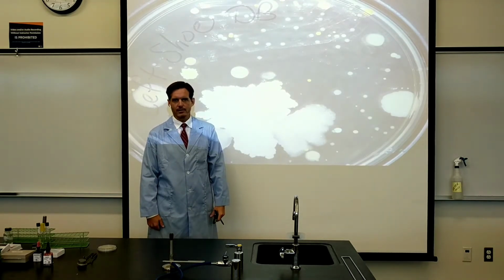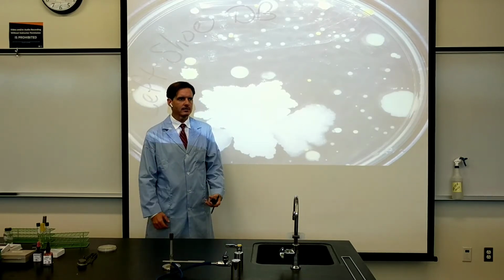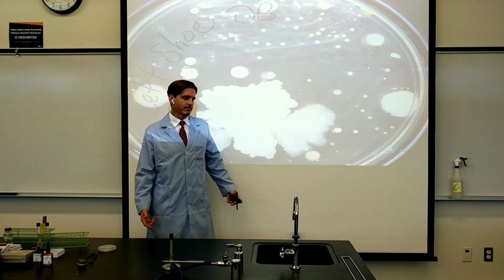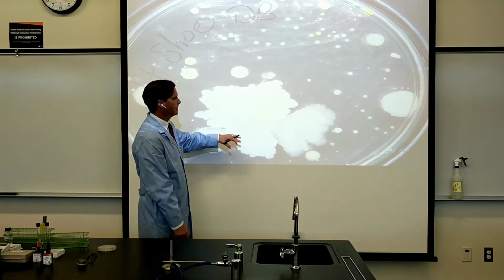Oof, it's kind of gross to think about, but those skin cells have bacteria stuck to them, and so dust commonly does carry bacteria, even from that one event, but dirt in general, very contaminated.